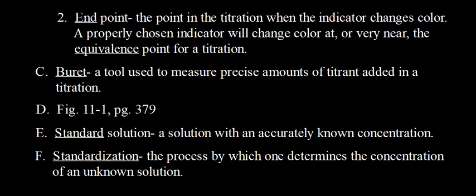All right, some vocabulary terms. The solution whose concentration is known is called the standard solution. So in our lab, you're going to standardize a solution. The word standardize means the process by which one determines the concentration of an unknown solution. So I'm going to give you some sodium hydroxide. Don't know its concentration. It'll be your job to determine the concentration of that solution. So you're going to standardize the sodium hydroxide solution.